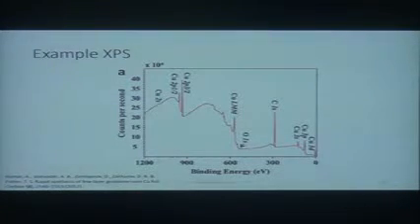And so this is a really good thing to look for when you have a sample, let's say with a background material that you know is there. A lot of times it'll be silicon because we do so much in nanotechnology with silicon, but you want to look for the silicon peaks because then you know that your system is working. In fact, you can use those peaks. If you have some kind of drift in your sample, you can actually use those known peaks to calibrate your source, right? That's done routinely by the expert.